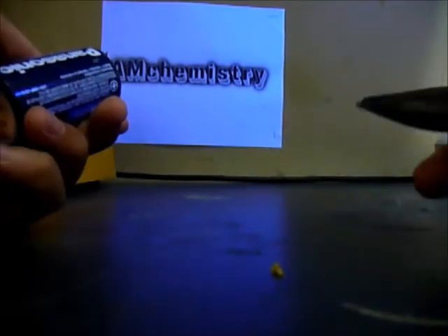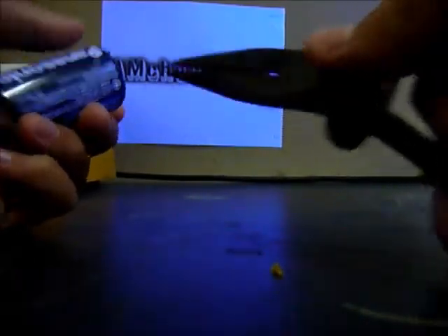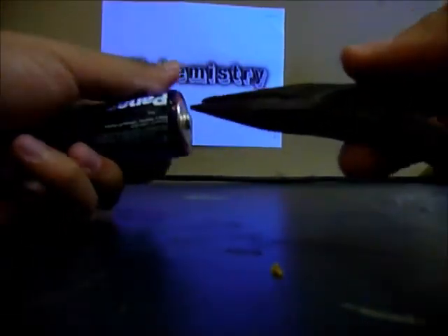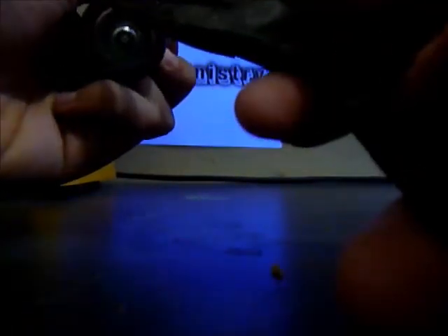So the tool you'll be needing is this. So first, just take off the outer shell, and it's made out of metal, so it's pretty easy to take off. So I'll show you when it's done.